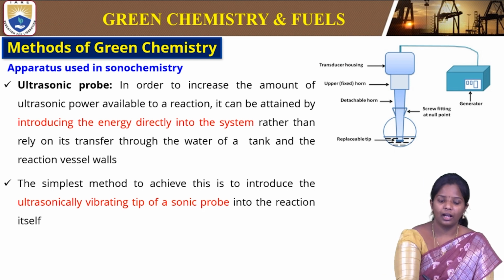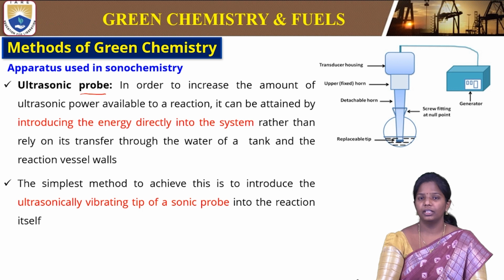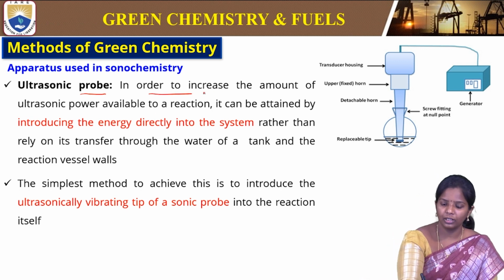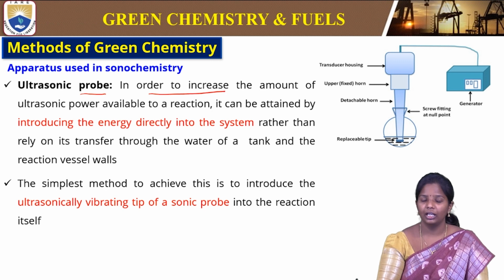Then there is the ultrasonic probe. Previously we inserted the vessels into the ultrasonic bath, but here we are just inserting the probe inside the vessel itself, in order to increase the amount of ultrasonic power available to the reaction. So what happens in this?